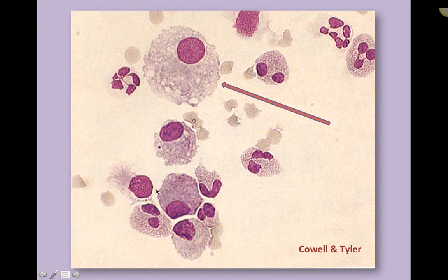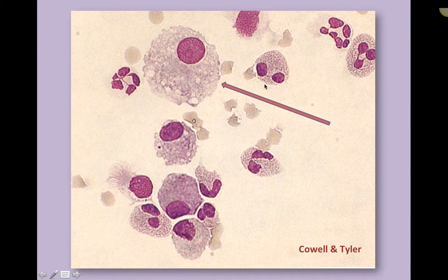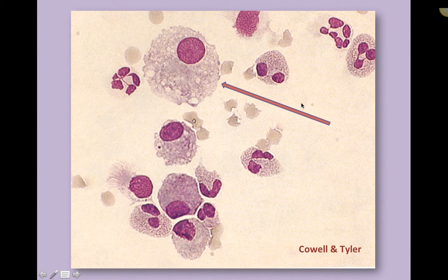This cell is called a ciliated columnar epithelial cell — it has a round purple nucleus and a long cytoplasm with little hairs at the end. It's specific to the respiratory tract. I'm pointing it out now because this picture will come back in tests and quizzes. And here are neutrophils, potentially eosinophils based on their coloration, and then a giant macrophage.